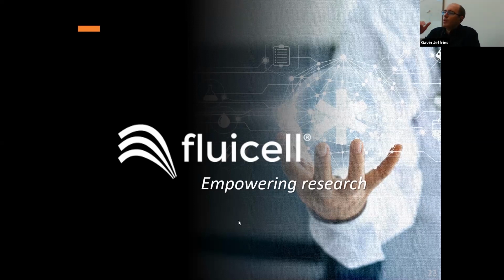When we're building it in 3 dimensions, generally we like to give at least overnight, if not 24 hours, between each layer, so that they can establish a level of communication and confluency as we're building up. In that regard, yes, we would probably give it 24 hours afterwards if we wanted to make sure that it's a fully interacted tissue structure.